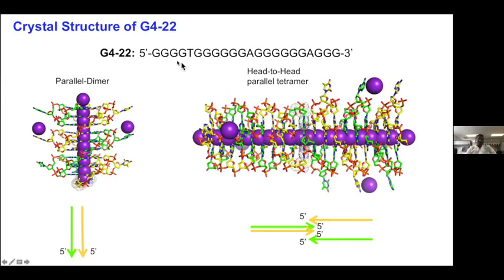So if you just look at the sequence, you would predict that since it's so G rich, it should form an intramolecular G4, but to our surprise, we see a nice parallel duplex formation with our sequence. It almost looks like a DNA double helix, I mean the B-DNA, which is the most common form of DNA. And we have an additional G here at the 5' that gets base paired with the 5' another G. Since it's parallel, it's open.